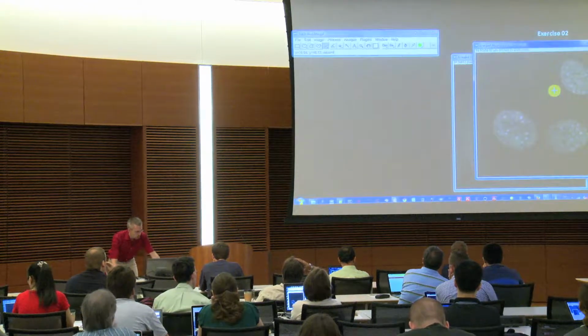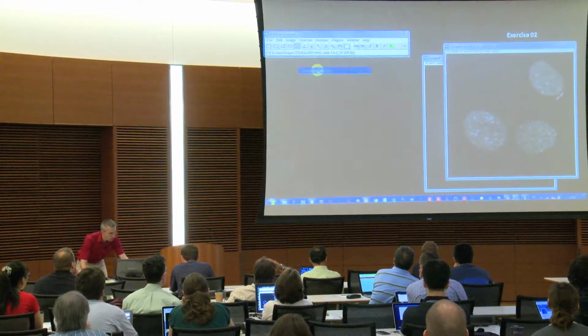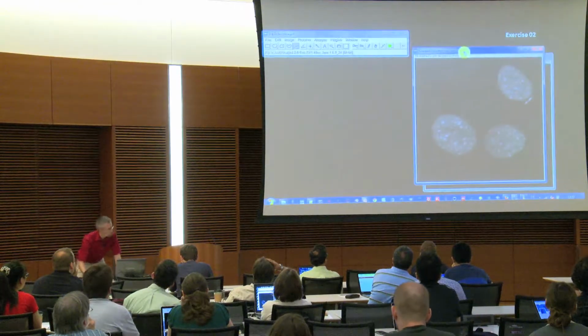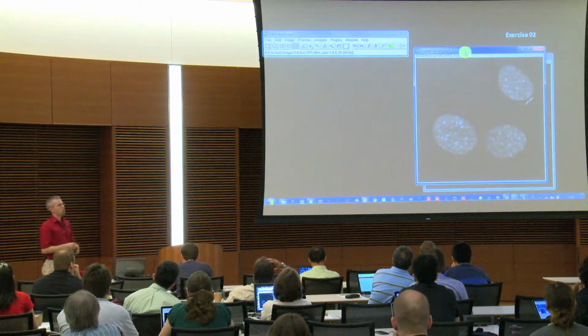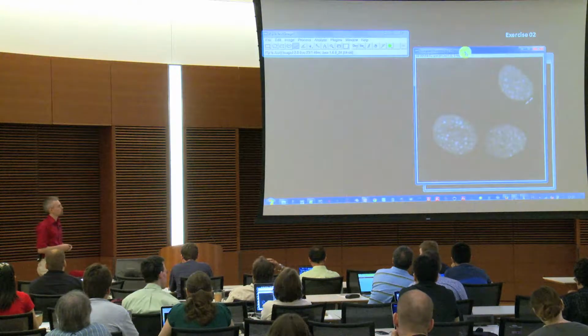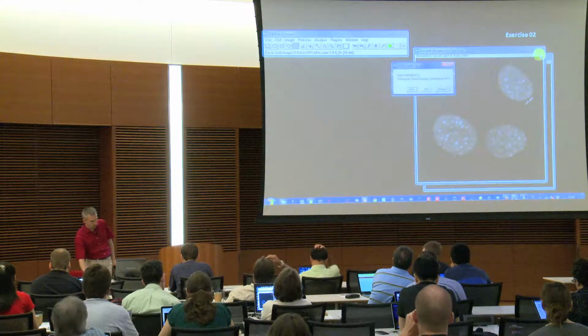So obviously now I have a low contrast. If I then in addition enhance, for example, the contrast or a little bit more, then I'm basically set up at a point where I can start doing further filtering and then the extraction, for example. So this is a possibility how this can be applied as well.